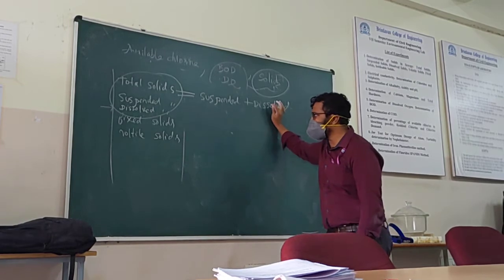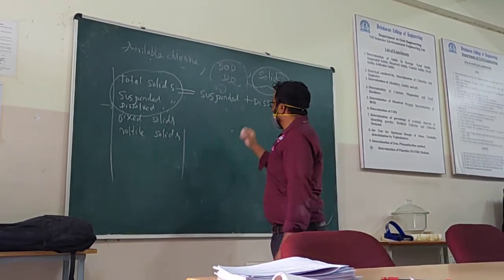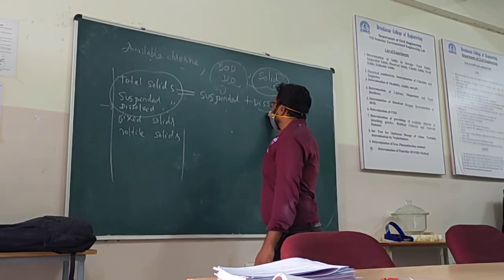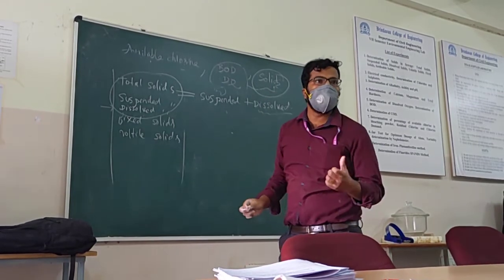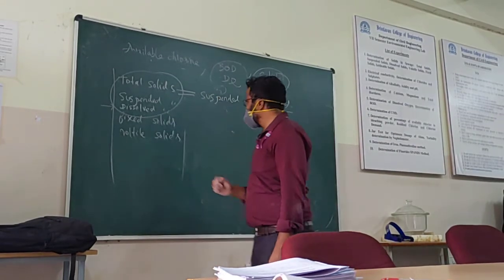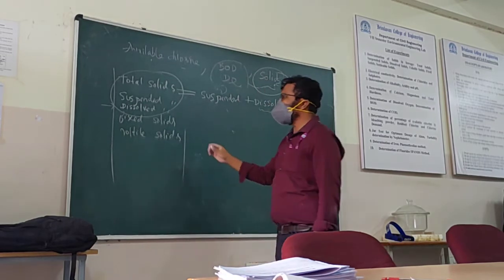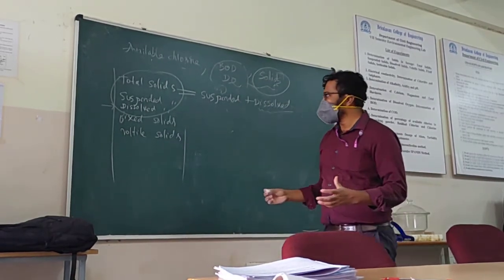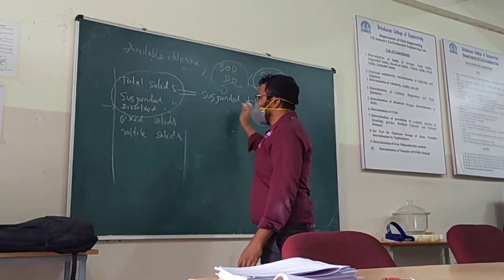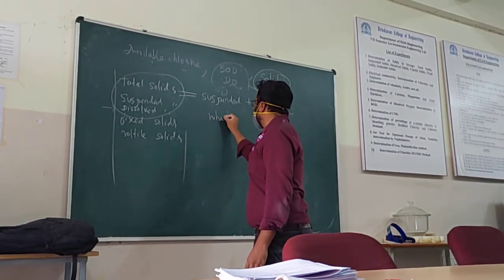We want to know what are all the solids which are just suspended, and what are all the solids which are completely dissolved, like how you see the salt. Okay. So first we will go with suspended solids to differentiate this in the total solids, because when you see solid water, we don't know how much these 2 things are. So just to separate this, we use Whatman filter paper.